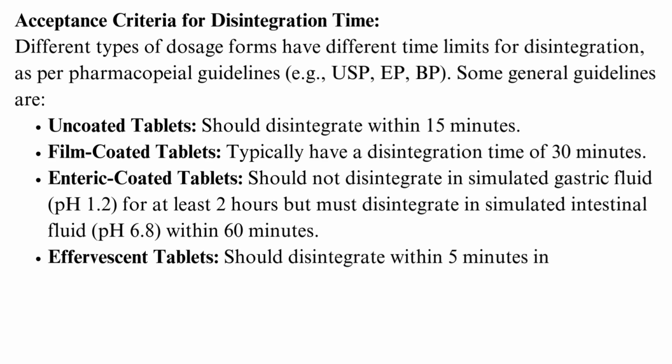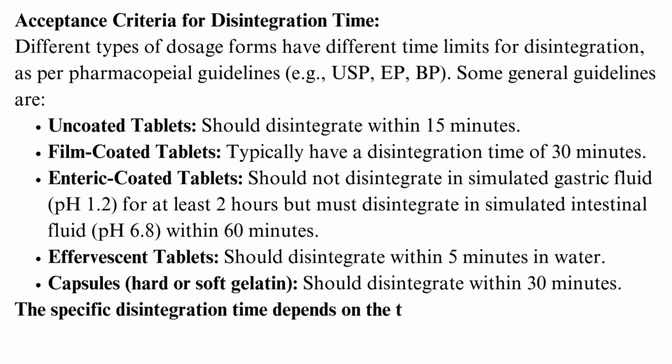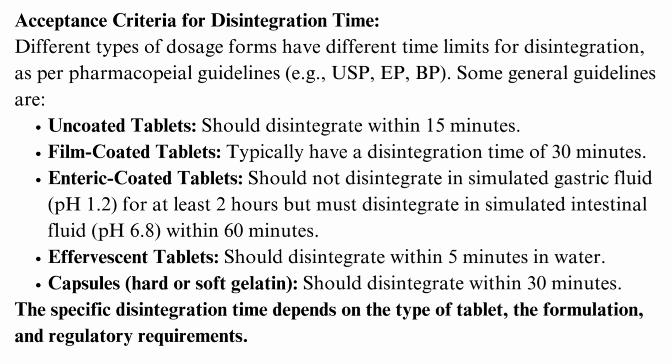Effervescent tablets should disintegrate within 5 minutes in water. Capsules, hard or soft gelatin, should disintegrate within 30 minutes. The specific disintegration time depends on the type of tablet, the formulation, and regulatory requirements.